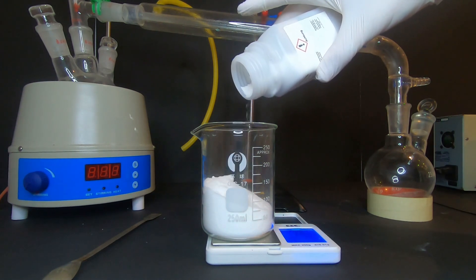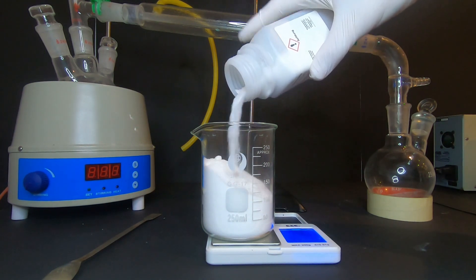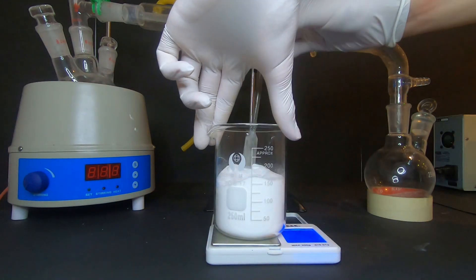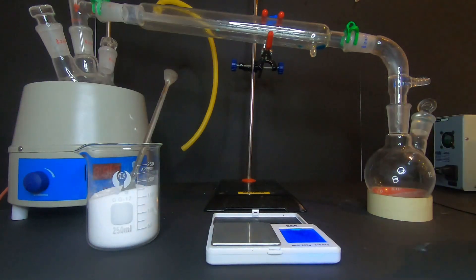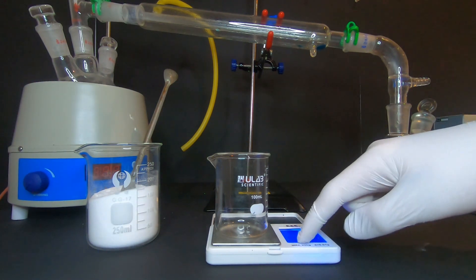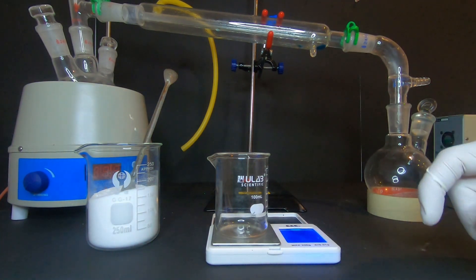First we measure out 125 grams of adipic acid in a beaker. For the reaction we still need the catalyst in the form of barium hydroxide, so after this we put 5 grams of barium hydroxide in a beaker.